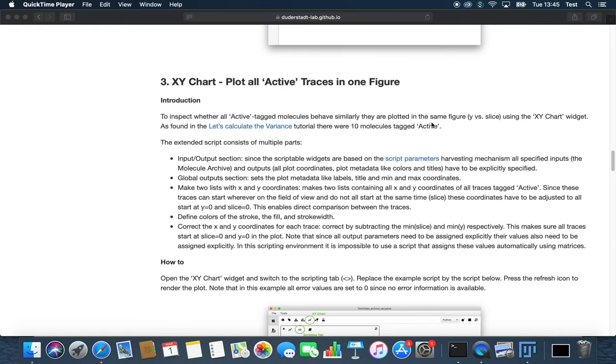We now have a look at the XY chart. The XY chart helps you to compare the traces of the active molecules.